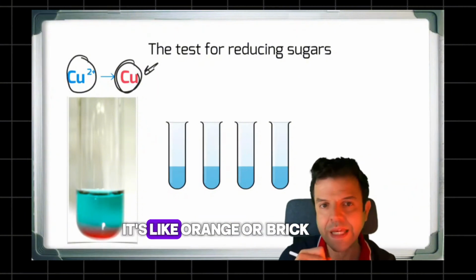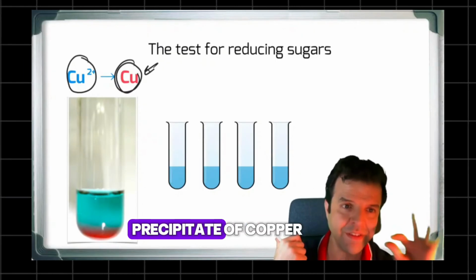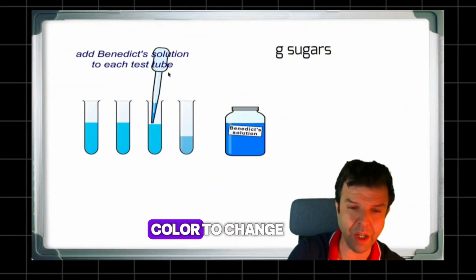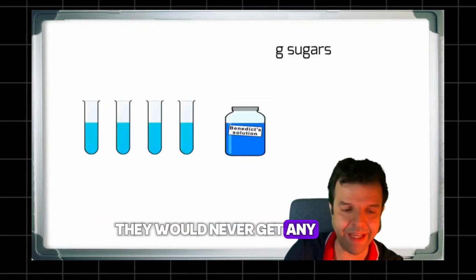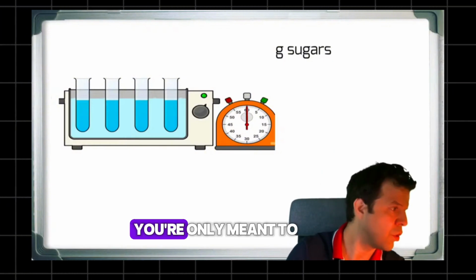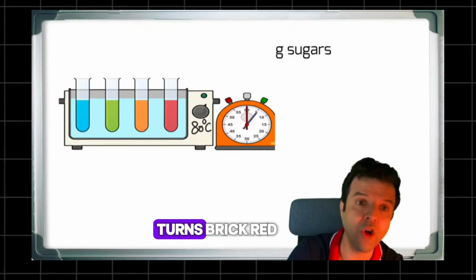What's the color of copper? It's like orange, brick red. The greater the copper you reduce with a reducing sugar, the more of that precipitate of copper you're going to get at the bottom of the test tube. When you add reducing sugar to it, you would expect the color to change, but this reaction requires heat. They will be disappointed if you don't heat. When I put it into heat, I did not say boil, I said heat, because you're only meant to heat up to 80 degrees Celsius. That's a number to remember. As you heat, you notice that the color turns brick red.